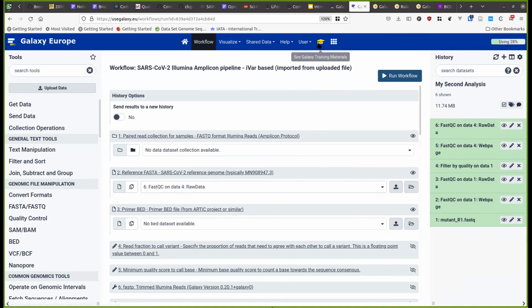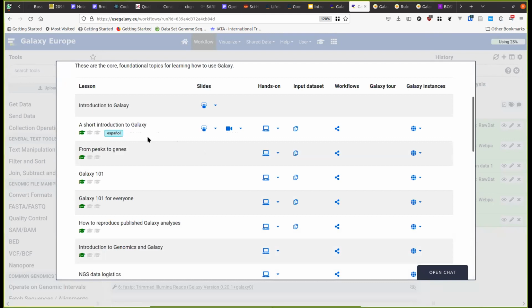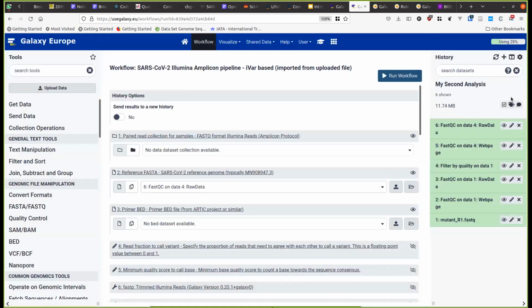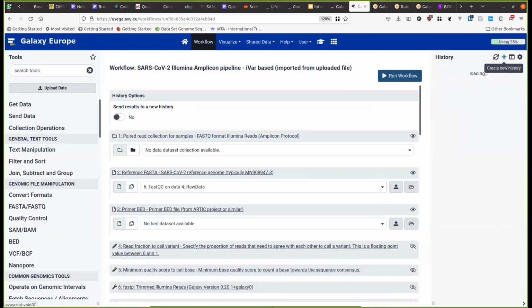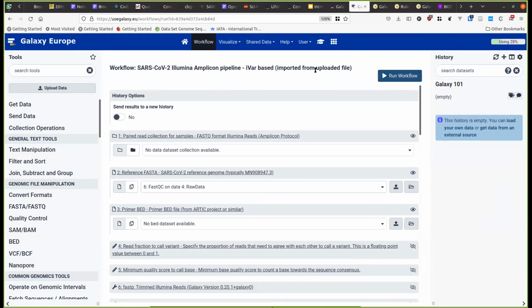So yeah, I wanted to get into the next tutorial, but just allow me to get myself a drink quickly. But I'm going to now do the Galaxy 101 tutorial. Okay. But obviously, what do I do before I start anything? I make a new history. So I'm going to call this one new history Galaxy 101, and I'll be back as soon as I've got something to drink.